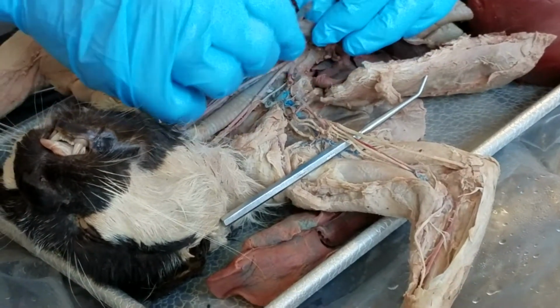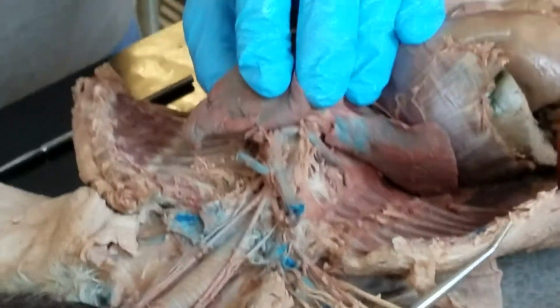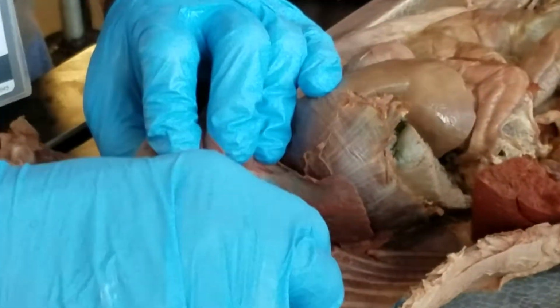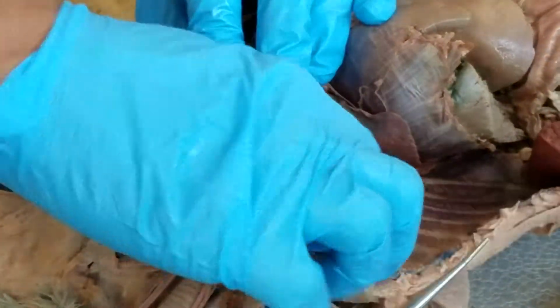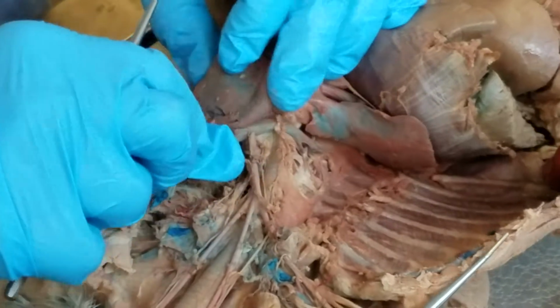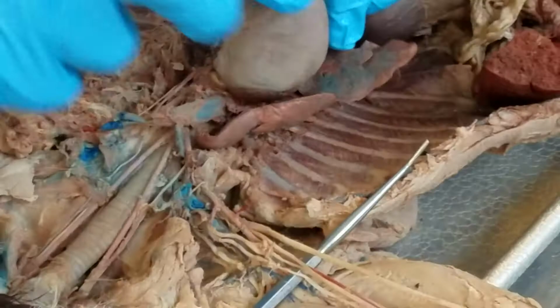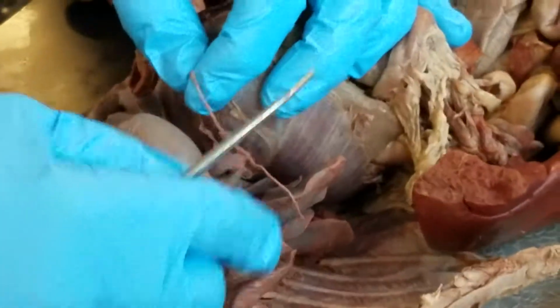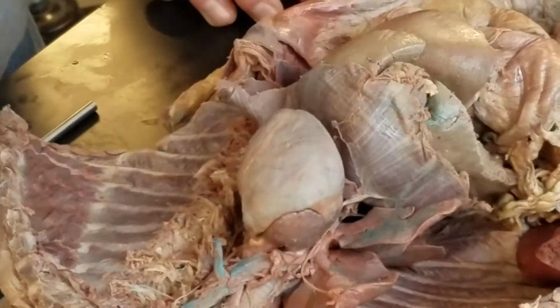All right, so now this big blue one is the superior vena cava. If we roll everything over this way, here will be your azygos vein, which was the bypass route or collateral route for the inferior vena cava, remember? It was coming up into the superior vena cava right here. You can see it entering. And if we come here underneath the heart, here's my inferior vena cava, and here's my right phrenic, because the right phrenic runs with the inferior vena cava right here. So that's how you remember this stuff.